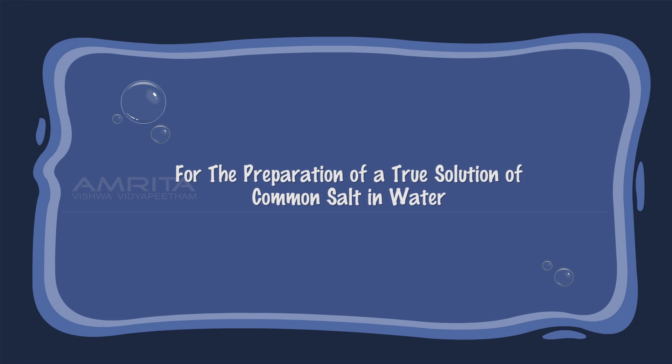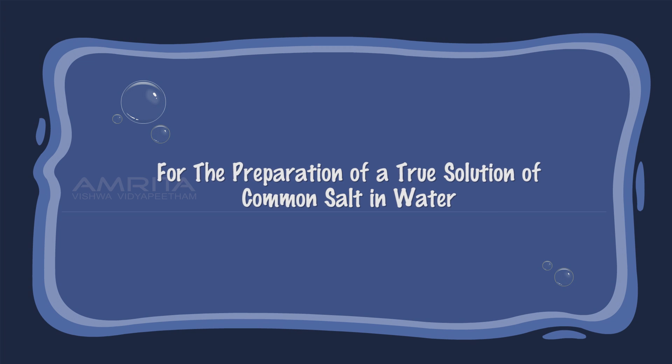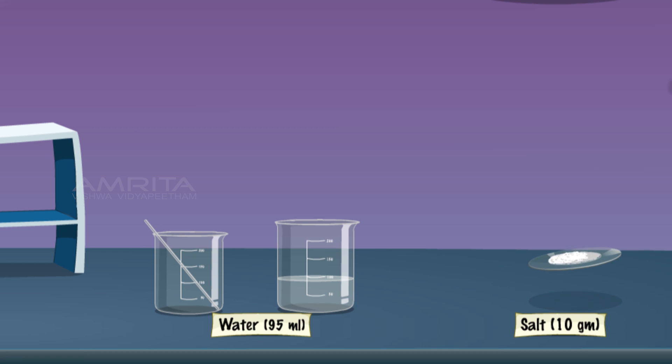For the preparation of a true solution of common salt in water, add 10g of fine powdered salt in a 250ml beaker containing 95ml distilled water. Then stir the solution using a glass rod until the salt dissolves.